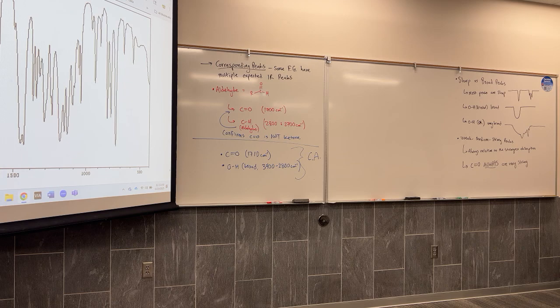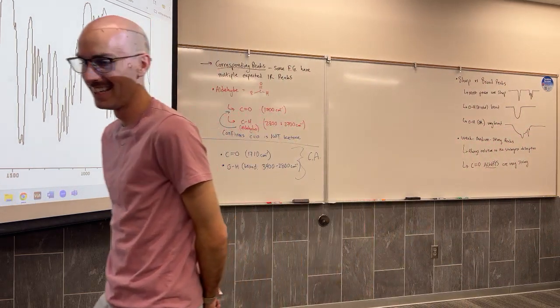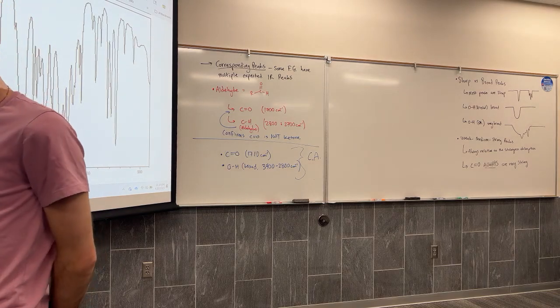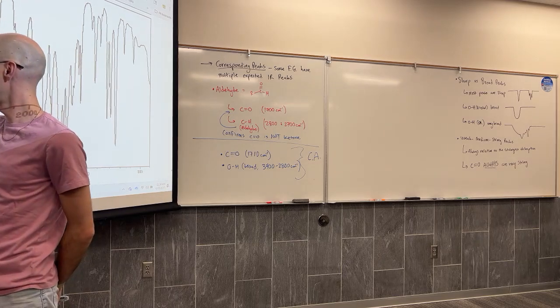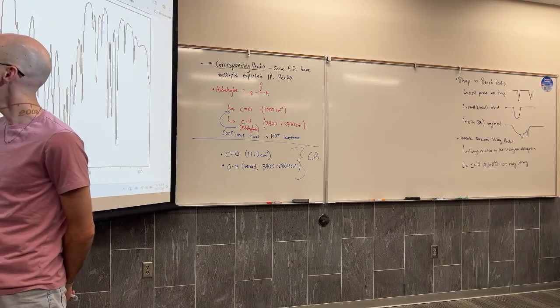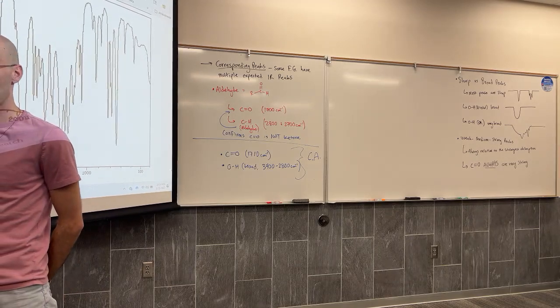You guys feel confident on anything? Define confidence. Do you have any that you really don't doubt, and some that maybe you have options for? Okay. The first one is a possible amine, right at just past 3,600. The next one is an aliphatic, right below the 3,000, because that's in a range of 3,000 to 2,800. Right there. What about these?